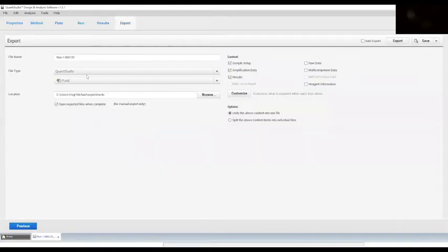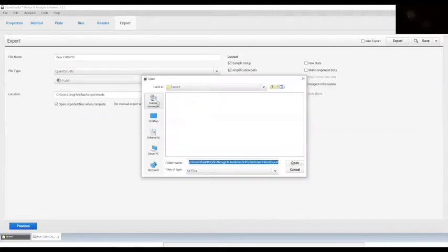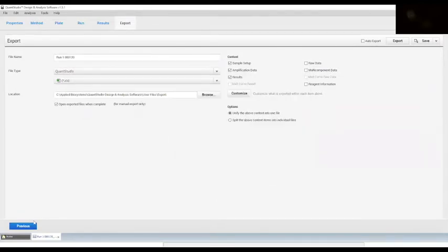Then go to export. Choose file type QuantStudio and then you can choose between the file types. I recommend to use it in an excel sheet because you can fill the information in an organized way.